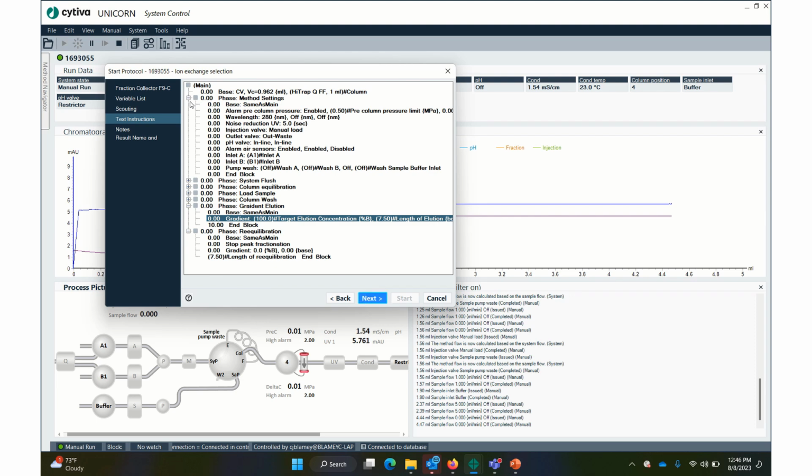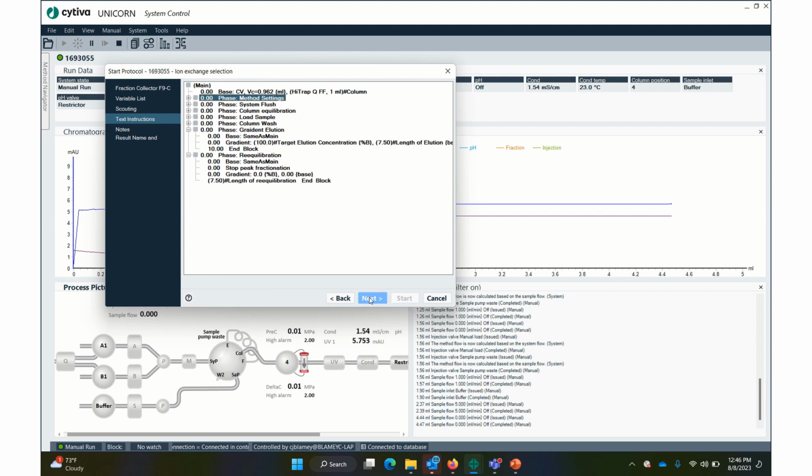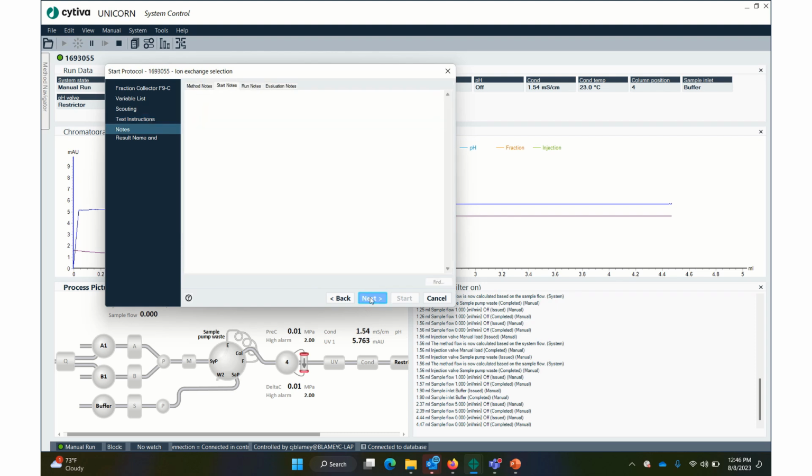Text instructions. This is everything we went through when we were writing the method. I have no notes. I'll just do Tris pH 9. I could write something like elution with 500 millimolar NaCl. Just real quick, right? Next.